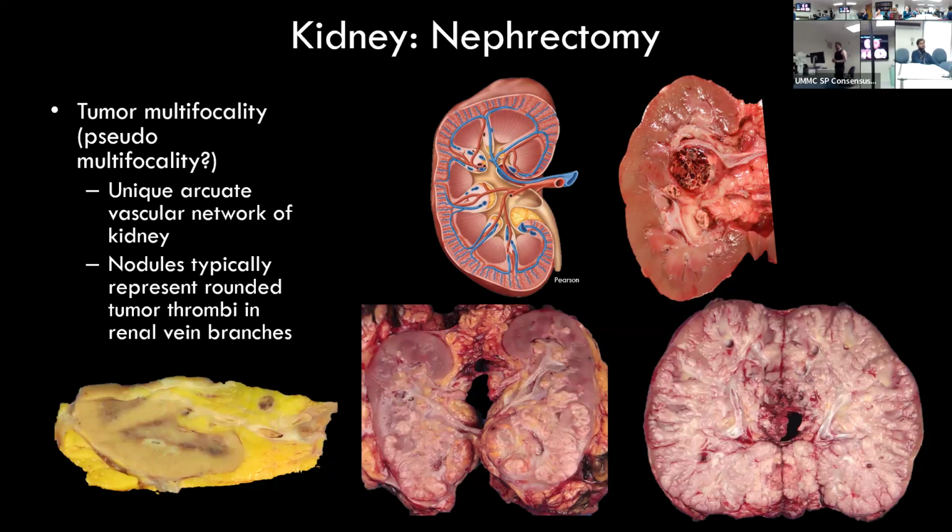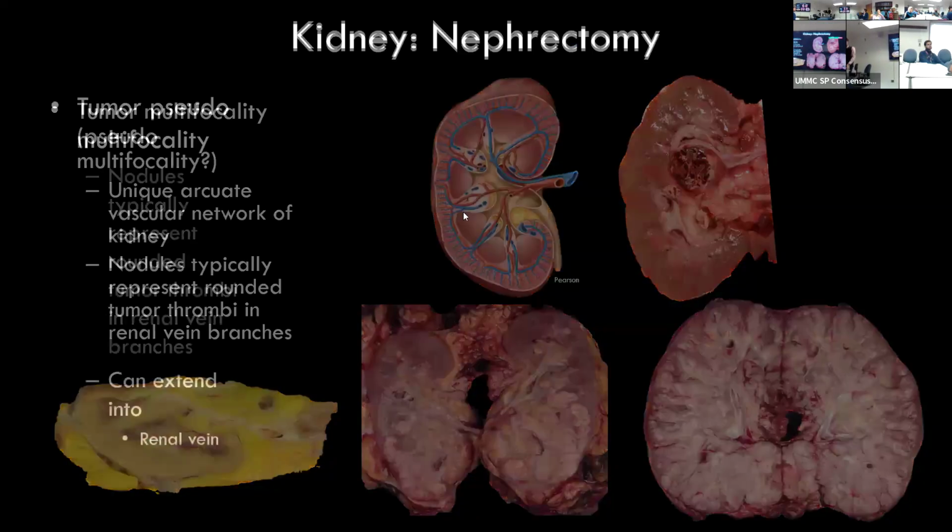Okay? Dr. Murugan, how should we measure this one? I will tell you in a brief moment, but you should make serial sections. So basically, you're trying to find connections. You're trying to ascertain that all these are actually the same tumor. So whatever is a close nodule, I would suggest you measure all of these together. Whatever is a nodule that's further apart, you can say that this might represent a vascular invasion instead of calling it a multifocal tumor.